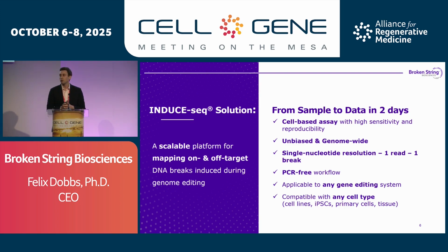And this is super important in the context of, say, a potential gene or cell therapy. We have an unbiased genome-wide measurement of all these potential sites, which gives us, while going very broad throughout the genome, a single nucleotide resolution readout of the events occurring where we're making the edits. The innovation around how INDUCE-seq works is in its novel PCR-free workflow that helps to eliminate the processing-induced biases from PCR.